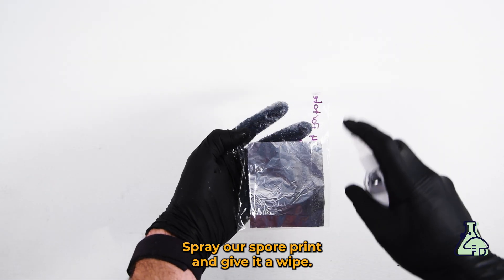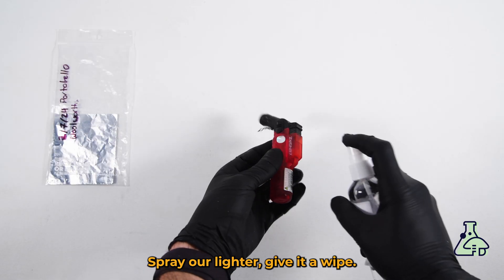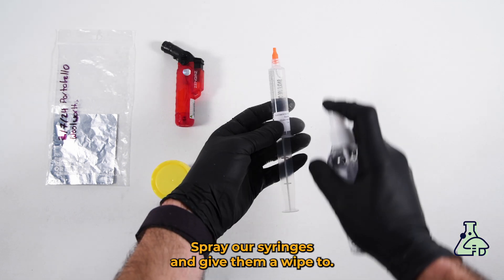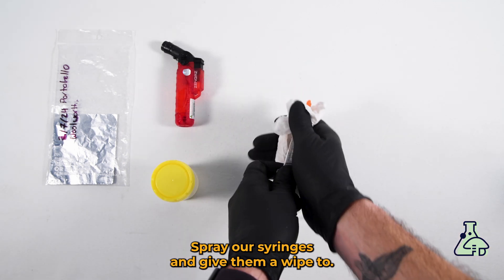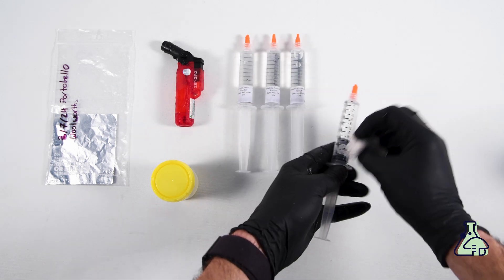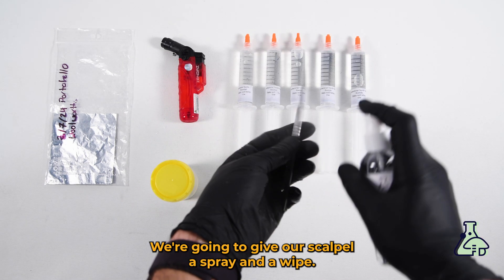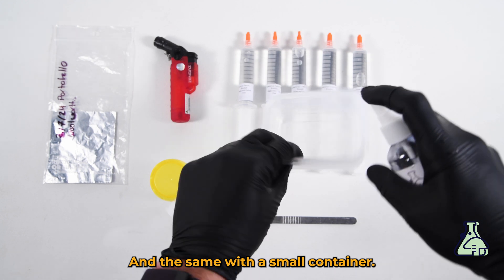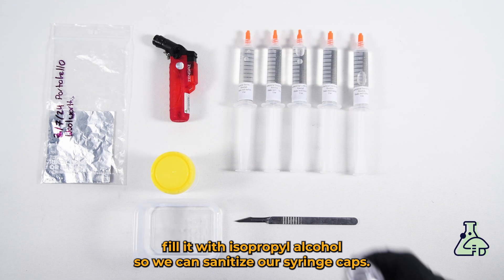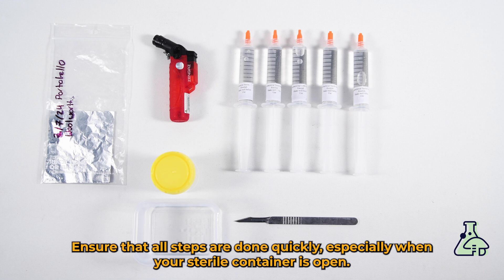Spray our spore print and give it a wipe, spray our lighter and give it a wipe, spray our container and give it a wipe, spray our syringes and give them a wipe too. We're going to give our scalpel a spray and a wipe, and the same with the small container. Then we're going to fill it with isopropyl alcohol so we can sanitize our syringe caps.